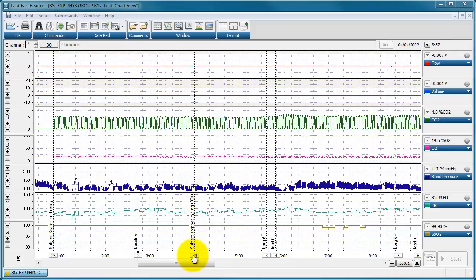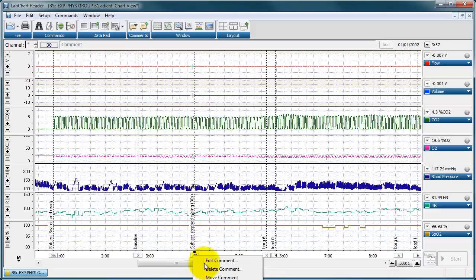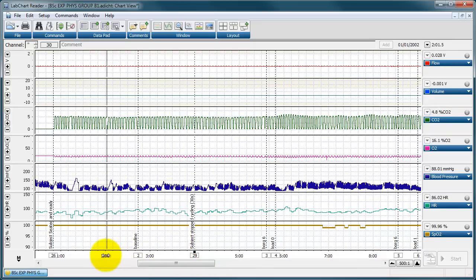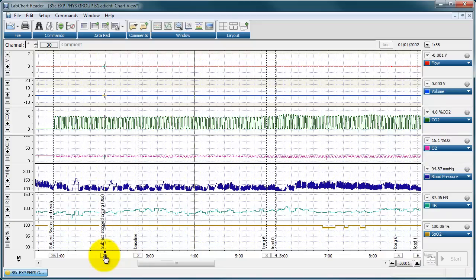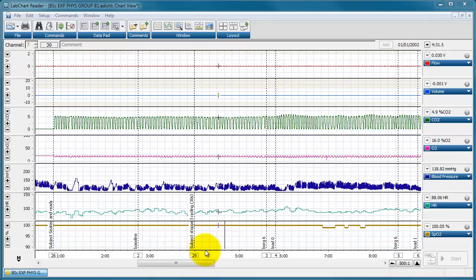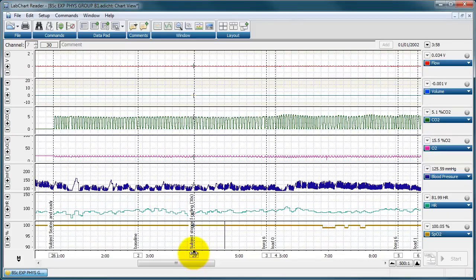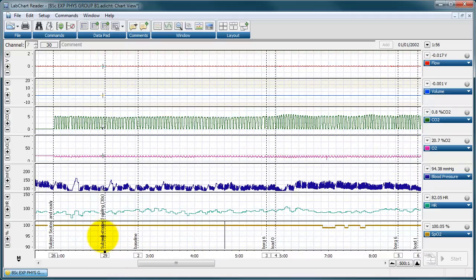You can also move comments. If you click on a comment number and right-click, you can select 'Move Comment' and drag it to the correct position. If you realise a marker was placed at 4 minutes but your lab book says it should be at 2 minutes, you can click the comment number — a double-headed arrow cursor appears — and drop it at the correct time. Bear in mind you cannot save these changes, so always get comments right at the time of recording.